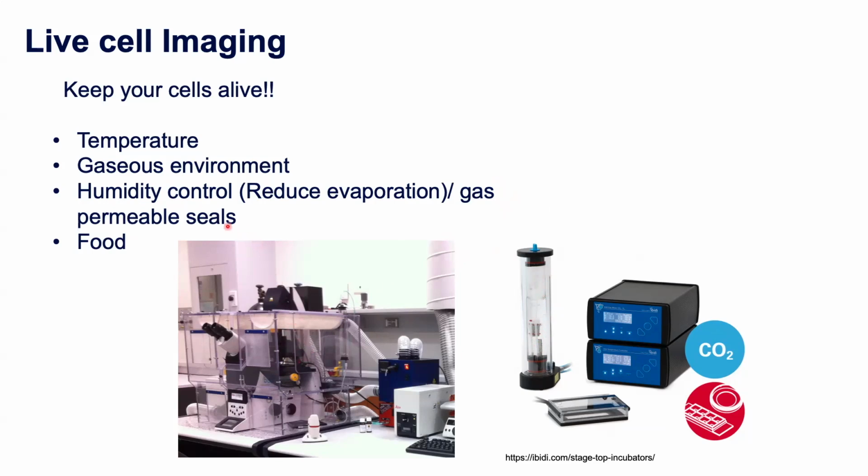The other thing we request researchers use is gas permeable seals, where you can actually seal in your sample. That still allows gas exchange, but doesn't allow evaporation. And certainly for longer term experiments, that can be very, very helpful. And then finally is making sure that there are enough nutrients in the media, or enough media there, to keep your samples alive and happy for an extended period of time.